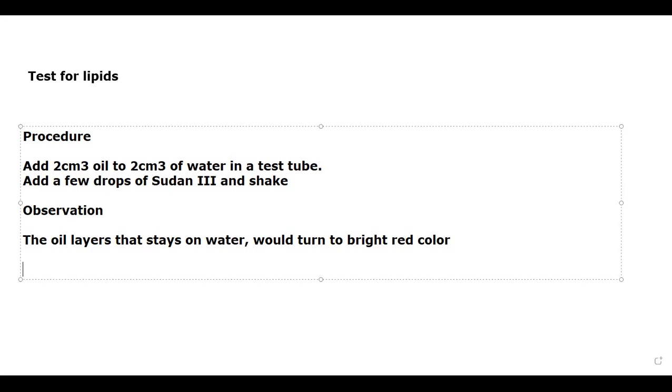Now coming for the next experiment, that is test for proteins. Test for proteins is also called by the name biuret test.